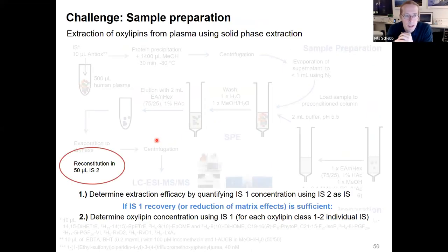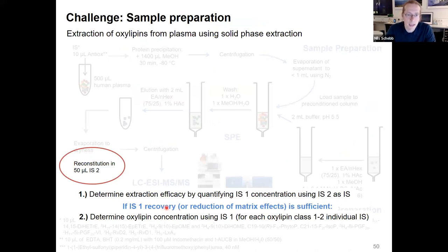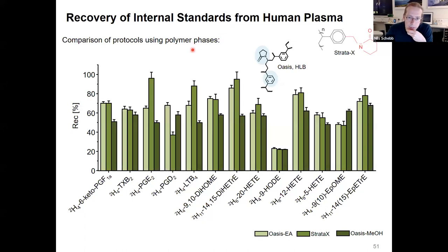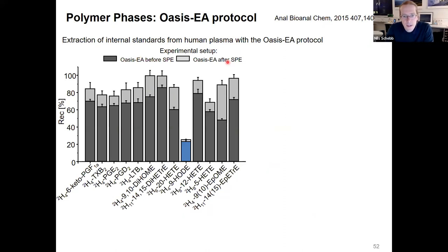One aspect I would really encourage everybody to do is to reconstitute the final extract in a second set of internal standards. You can then use this second set of internal standards to quantify the amount of internal standards in your sample and use this as a quality control for each extracted sample. When we started doing this using polymer phases for solid phase extraction, we figured out that the internal standard recovery for some internal standards, like 9-HODE, was really poor, which led us to hypothesize that this was caused by ion suppression.